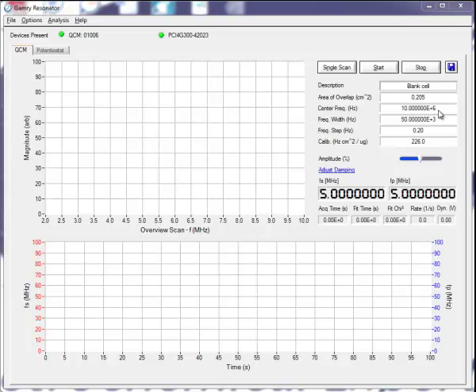Hello, my name is Chris Beasley, and the purpose of this short video is to show you how to find the resonant frequencies of a quartz crystal. I have a 10 MHz gold-coated quartz crystal mounted in our Teflon cell filled with water.